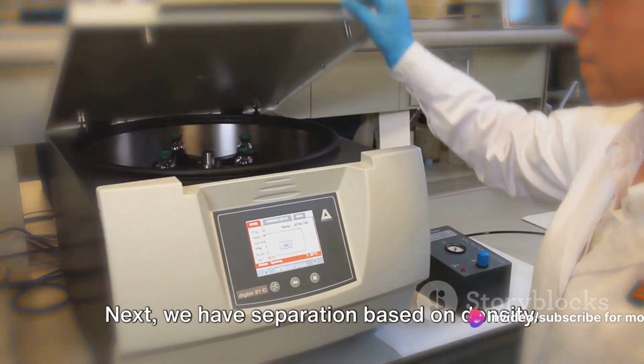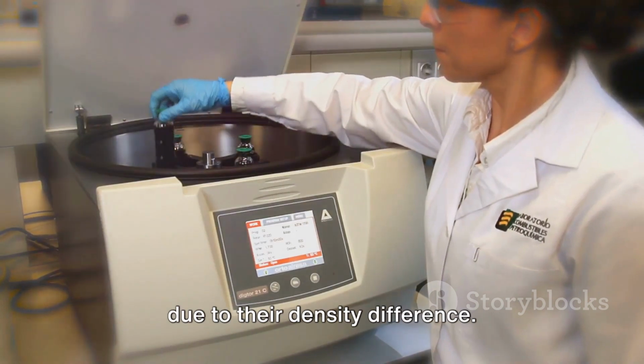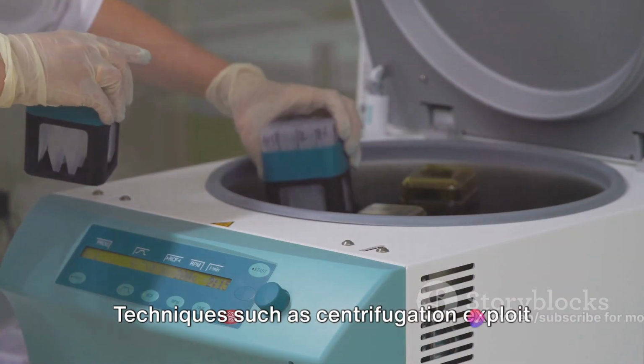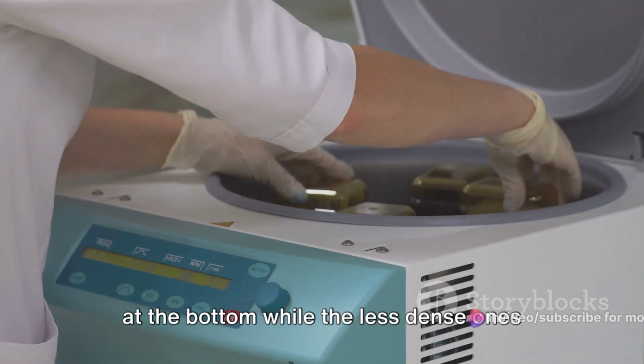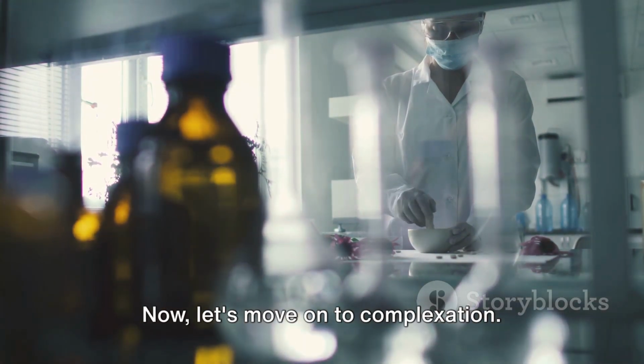Next, we have separation based on density. It's similar to how oil floats on water due to their density difference. Techniques such as centrifugation exploit this principle. The denser components in a mixture settle at the bottom, while the less dense ones float, allowing us to separate them.